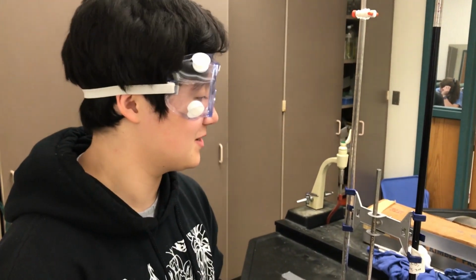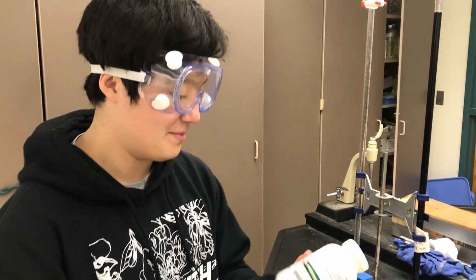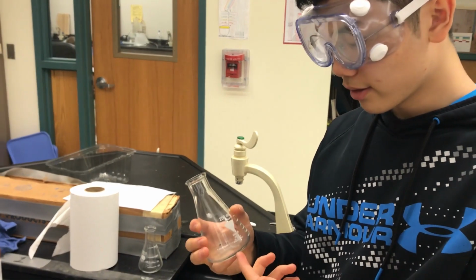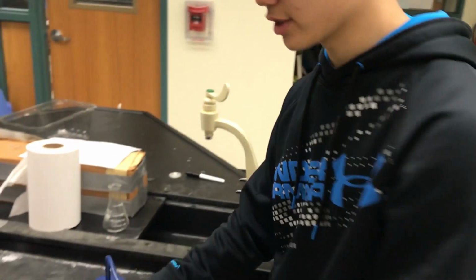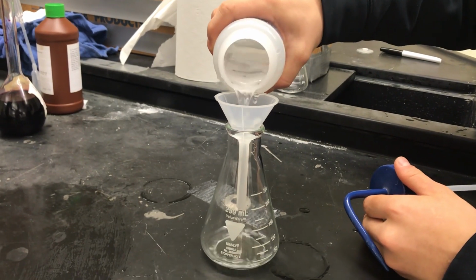In order to make sure that we've achieved accurate measurements, we've got to standardize our solution. To do that, we will use iron ammonium sulfate. Our next step is to fill this 250 milliliter Erlenmeyer flask with about 15 milliliters of distilled water. Remember, it doesn't have to be exact, but it has to be at least close.